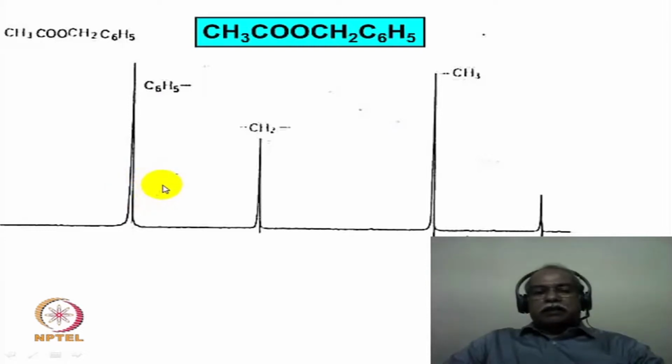Normally, a phenyl derivative with an electron withdrawing group or electron donating group, such as a nitro group or amino group, would appear as a multiplet in the region. Anytime in the aromatic region of about 7 to 7.5 ppm, a multiplet is observed with 5 hydrogen intensity, the inference is that it is a monosubstituted phenyl derivative.